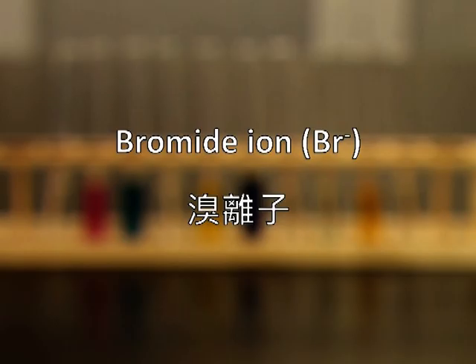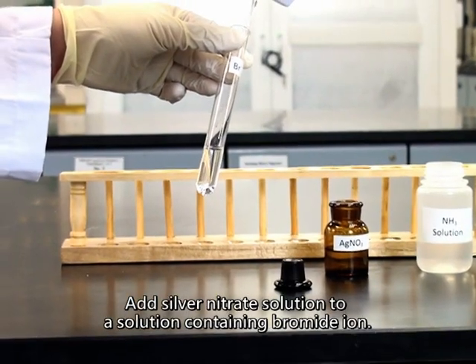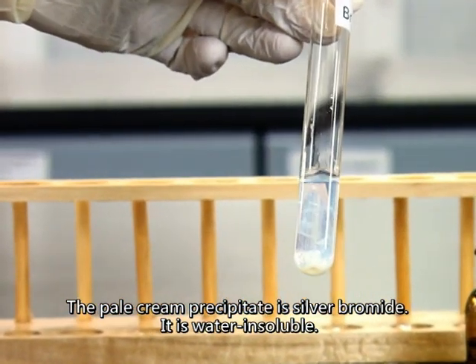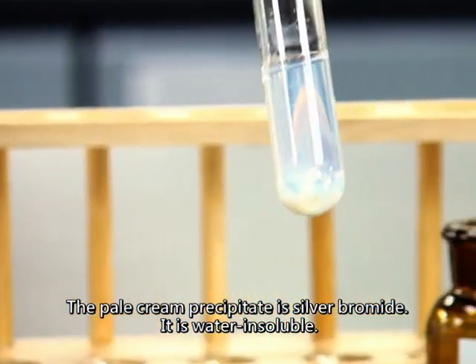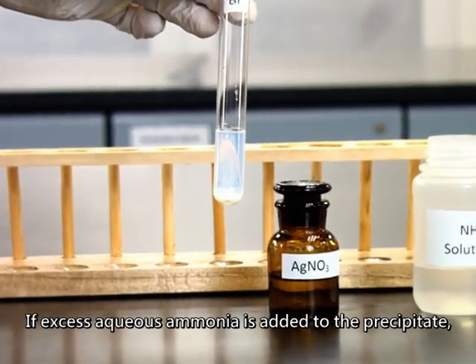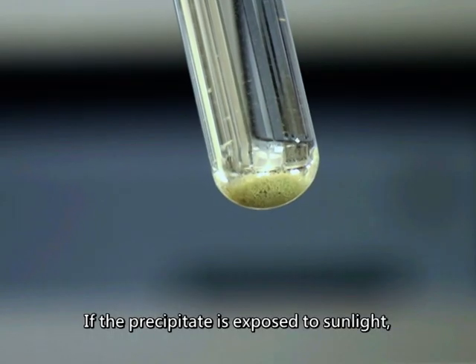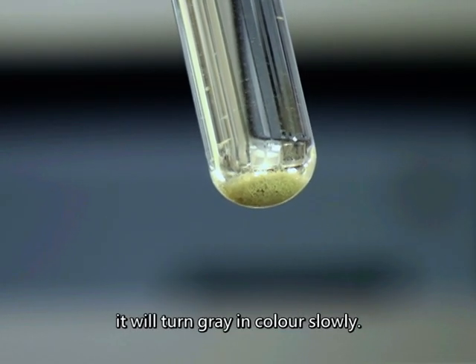Bromide ion. Add silver nitrate solution to a solution containing bromide ion. A pale cream precipitate is formed. The pale cream precipitate is silver bromide. It is water insoluble. If excess aqueous ammonia solution is added, the precipitate will dissolve slightly. If the precipitate is exposed to sunlight, it will turn gray in color slowly.